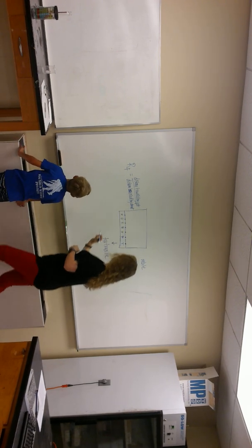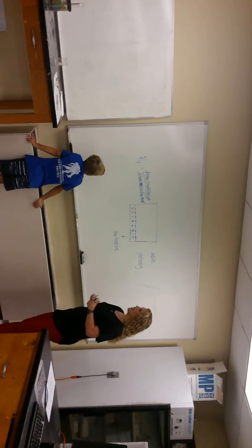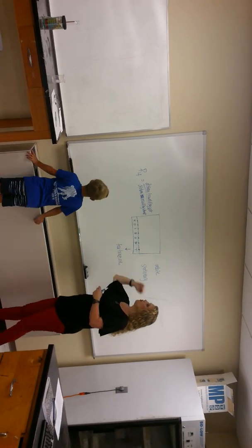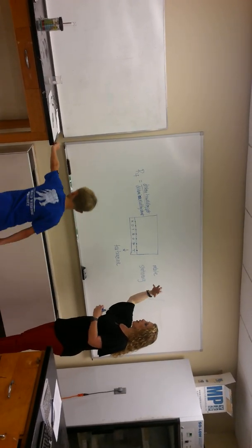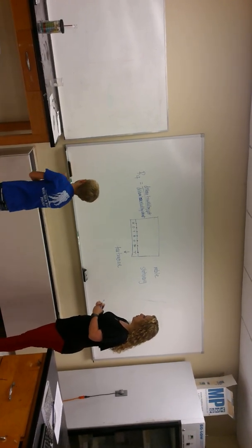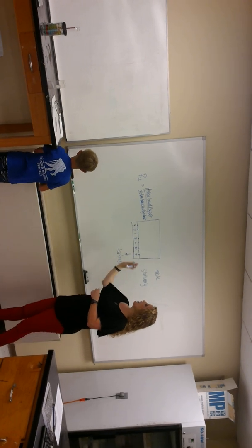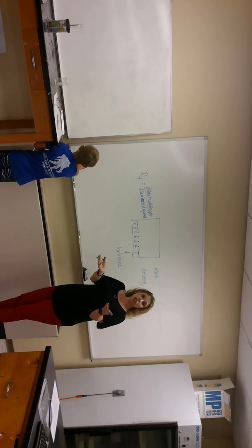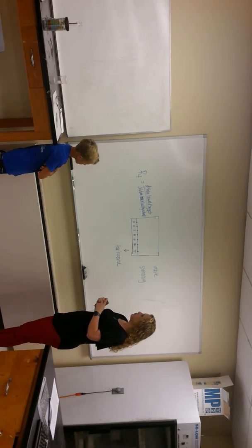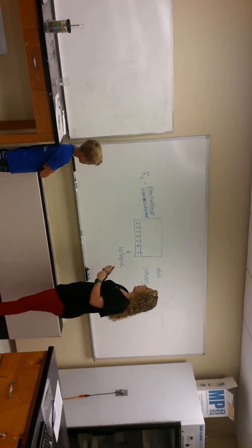We're going to find that for tartrazine, our standard, and we're going to compare it to the RF factors of our different separations of our dyes of each color of our plain M&M, okay? So if they have the same RF factor, we can assume that that's going to be yellow dye number 5, okay? Now, I'm talking about our spots.